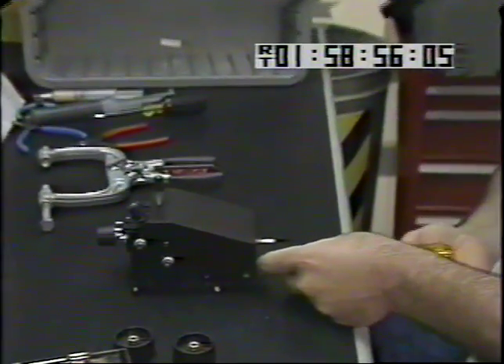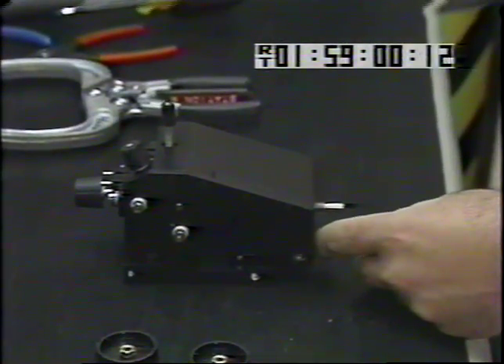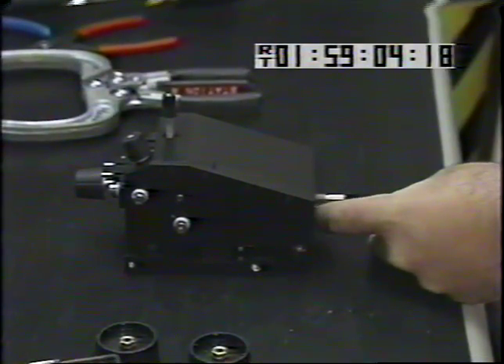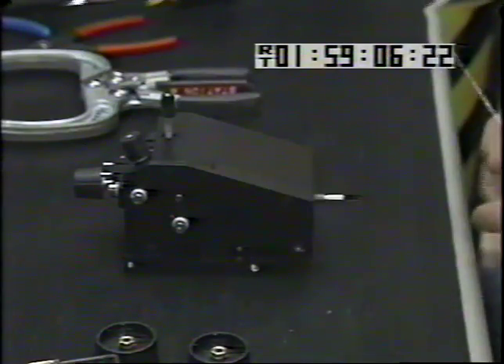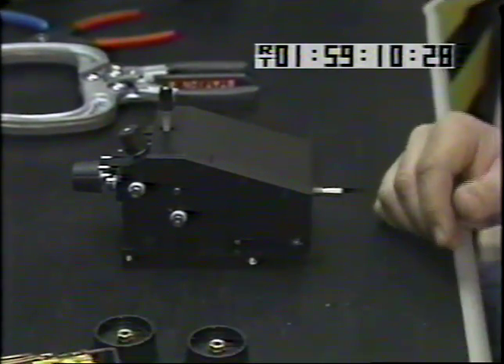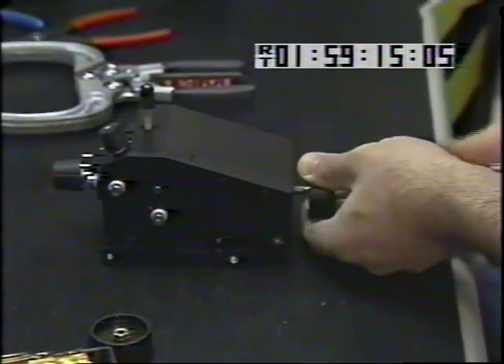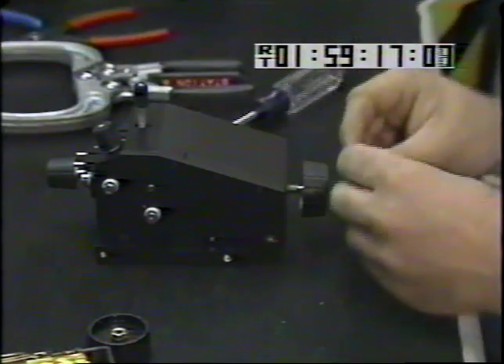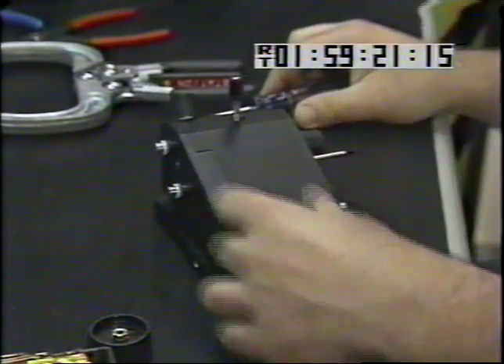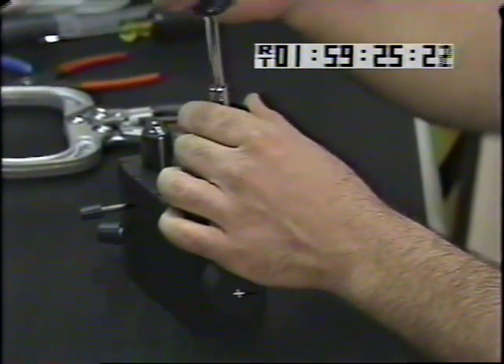At this particular workstation, the operator is building the head adjust assembly, which is used to control the nozzle drive in the final machine to locate the stream in the laser beam, so that it not only intersects the laser beam but also then fires into the collection system in the catcher tray at the bottom of the assembly of the FacStar unit.